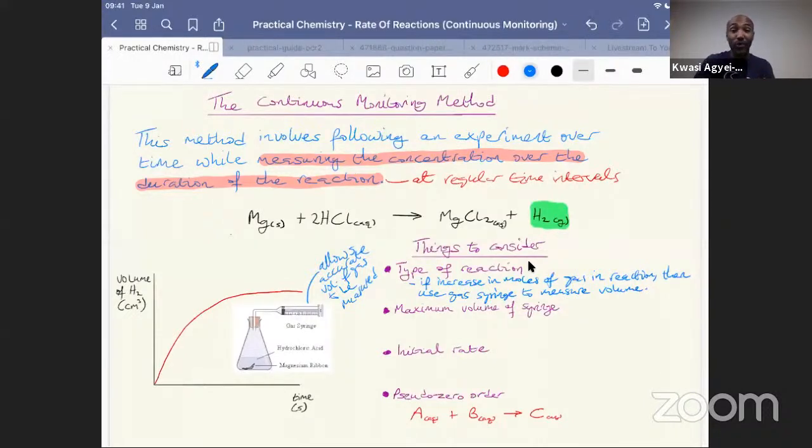Okay, you can also measure the rate of production of your gas by looking at the mass loss. If you leave your container open so that the gas escapes and you've got that container sitting on the balance, then you can measure in real time how much gas is being produced because of the mass loss due to the gas escaping. And we'll look at that in a little while.